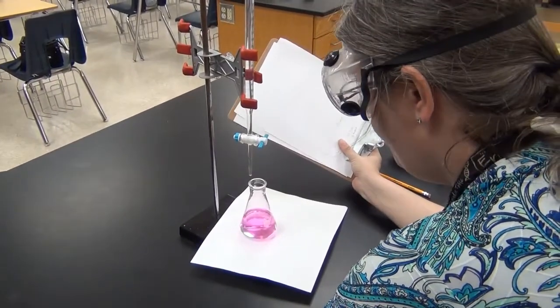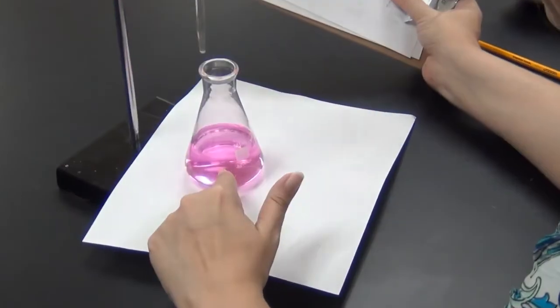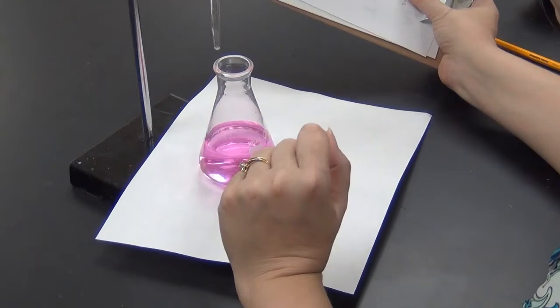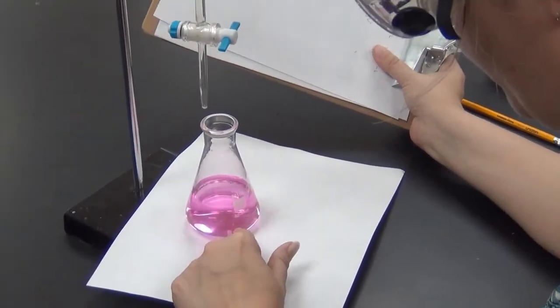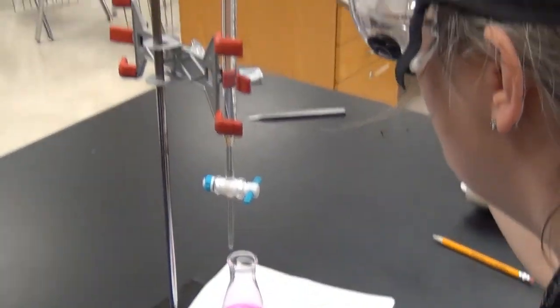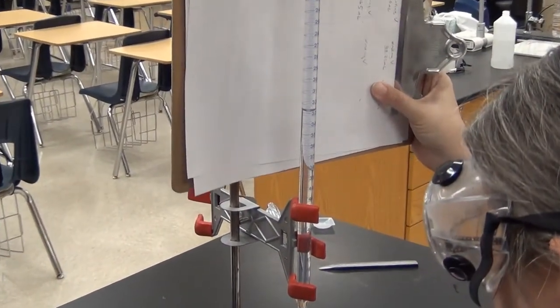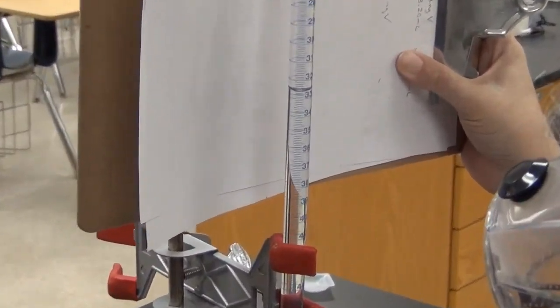So you can see we've reached the end point of our titration with our third sample here, our second acid sample, because we have a persistent pale pink color. So now I'm gonna have to bend down to get to eye level so I can get a good accurate measurement, and put the paper up to help me read this.